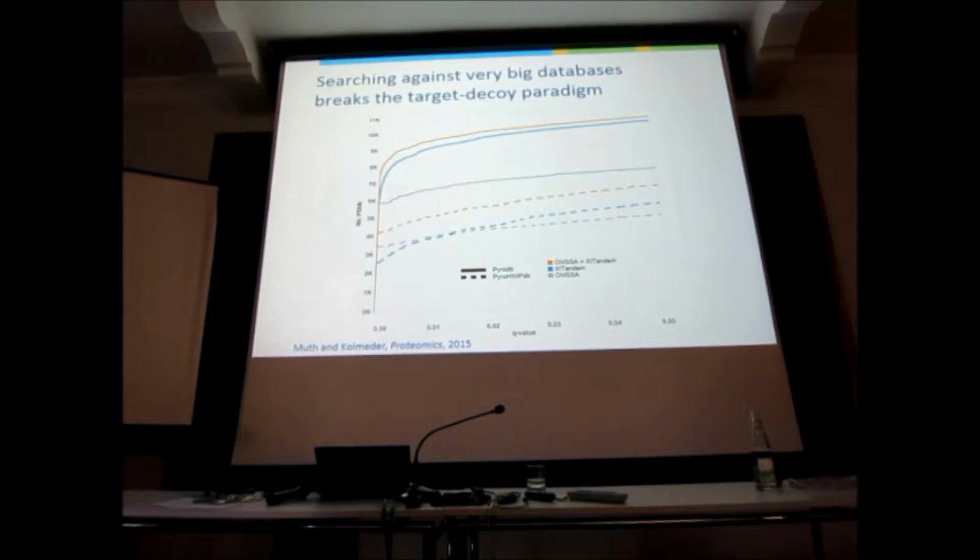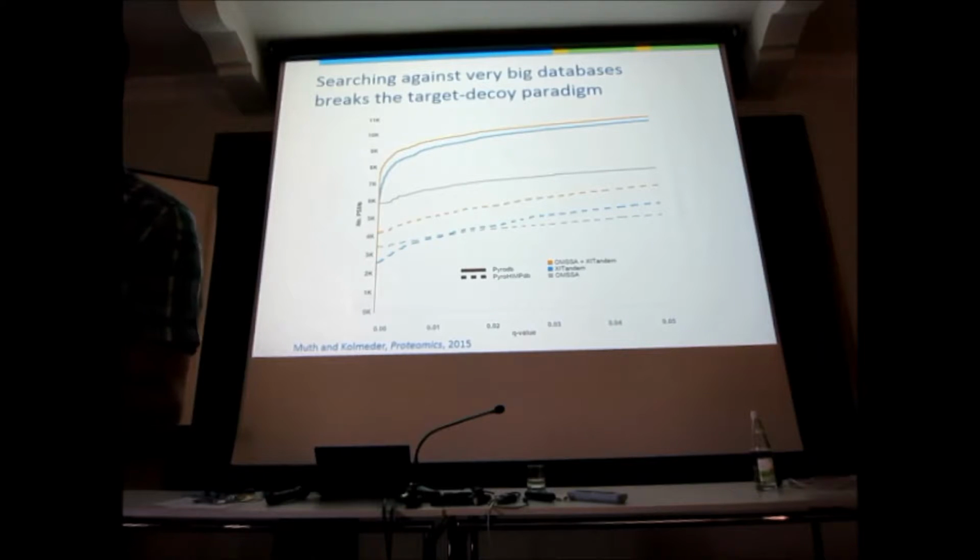Second, the harder the task gets, the more benefit you get from multiple search engines. Okay? So teamwork matters when it gets hard. But the problem, of course, remains that this is very unsettling. At 1% FDR, we go from roughly 9,800 to 4,500 hits. That's half of the stuff, poof. It's really, really annoying. And it's just because we changed the database.